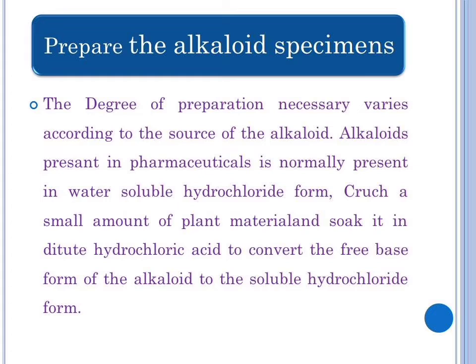Add about 3 ml of distilled or deionized water to the tube and swirl it thoroughly to mix the contents. Stand the tubes in the test tube rack or a beaker and allow the specimens to dissolve. Don't worry, not all of the powder goes into the solution. So record each tube's contents in the notebook.